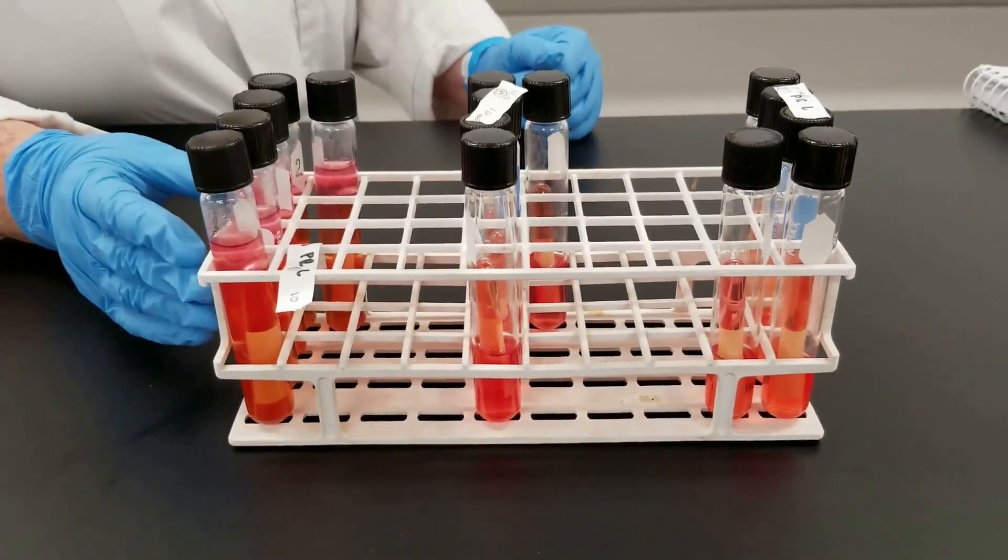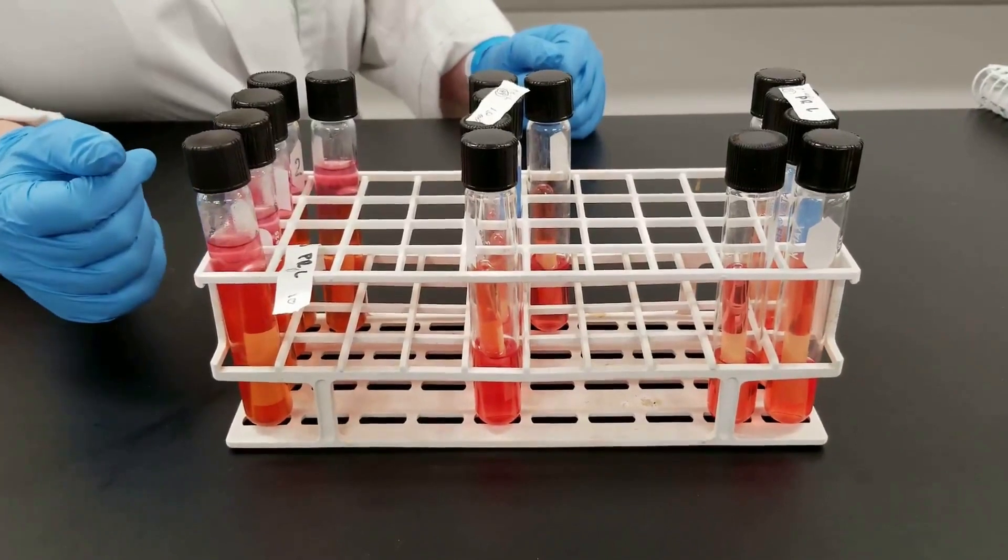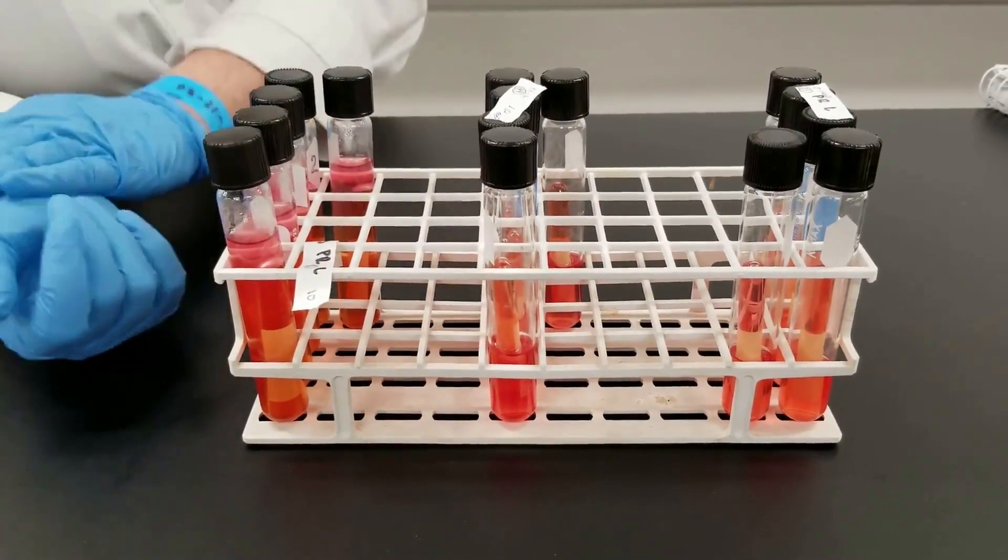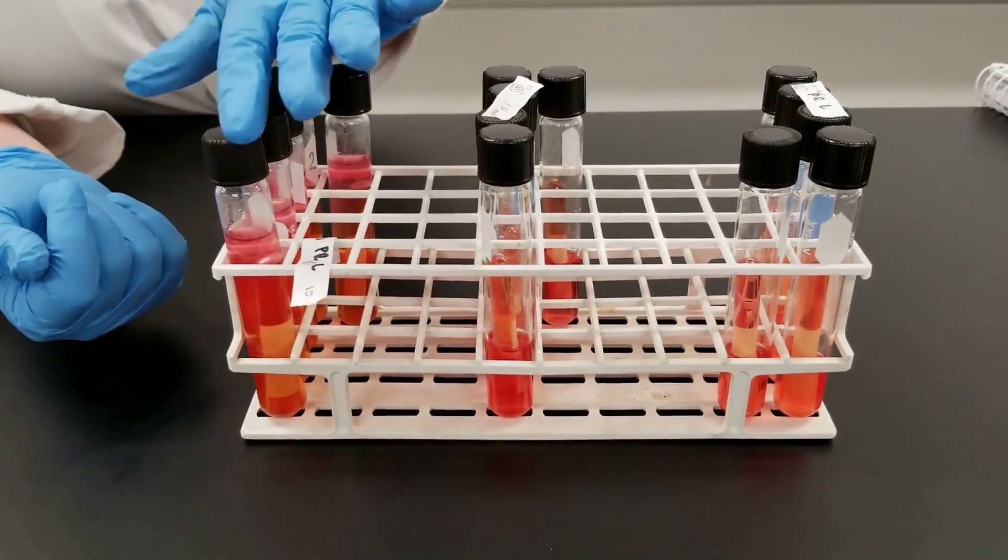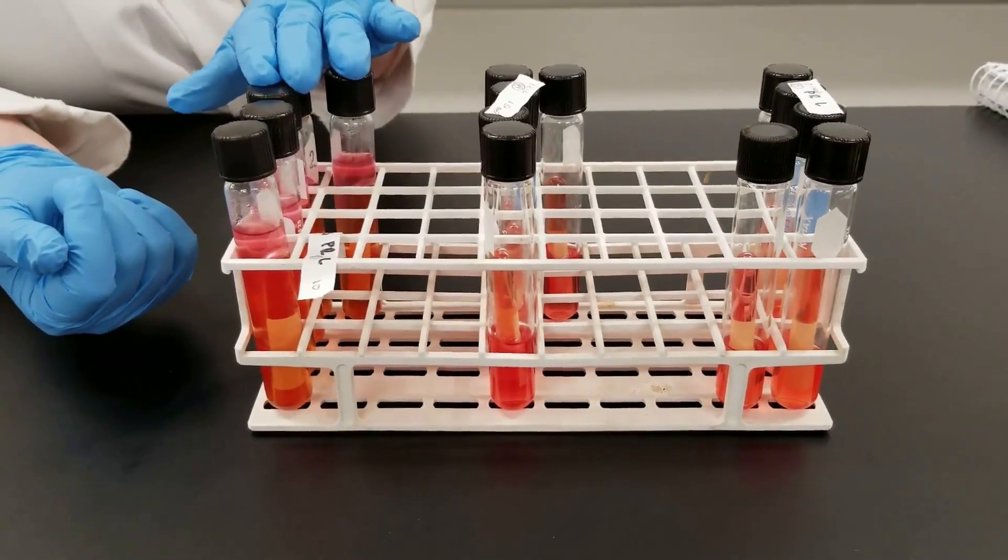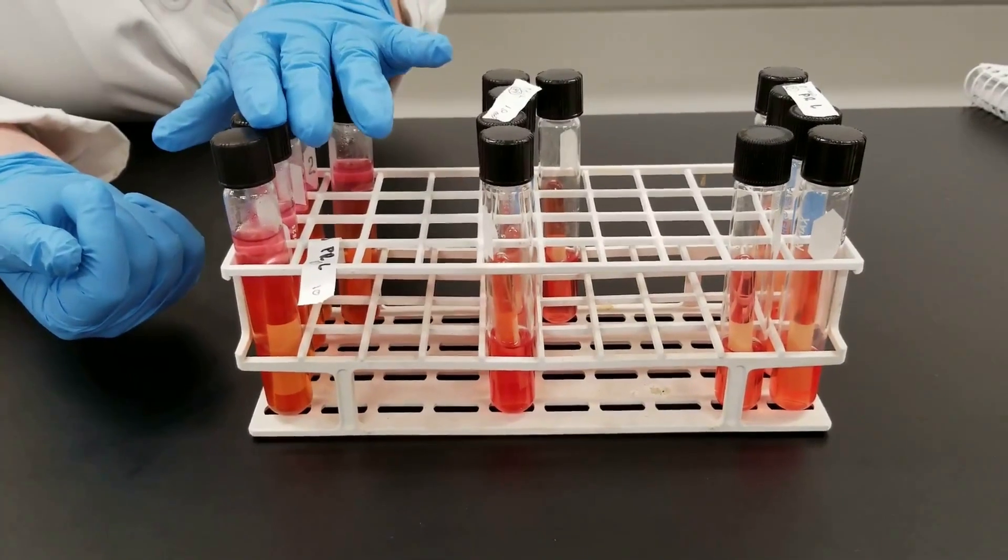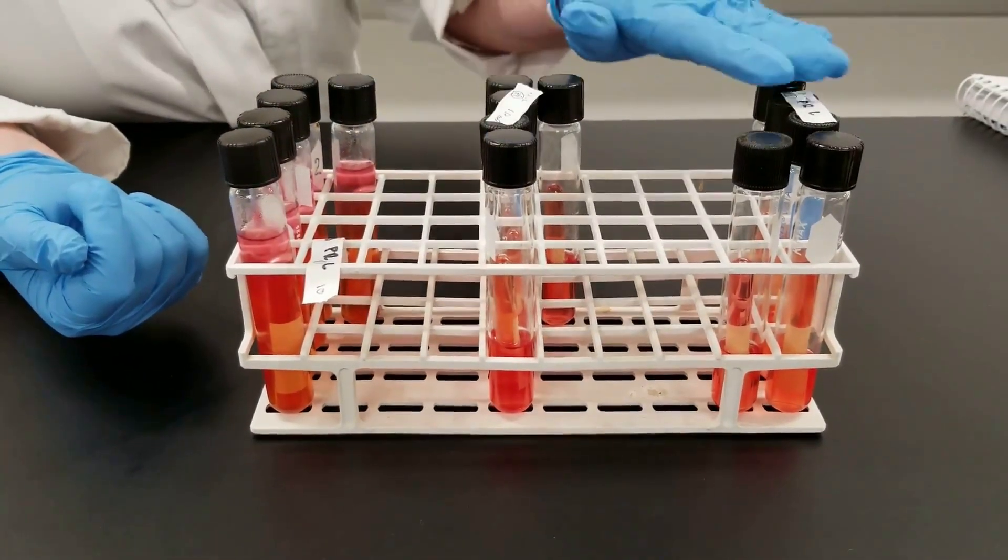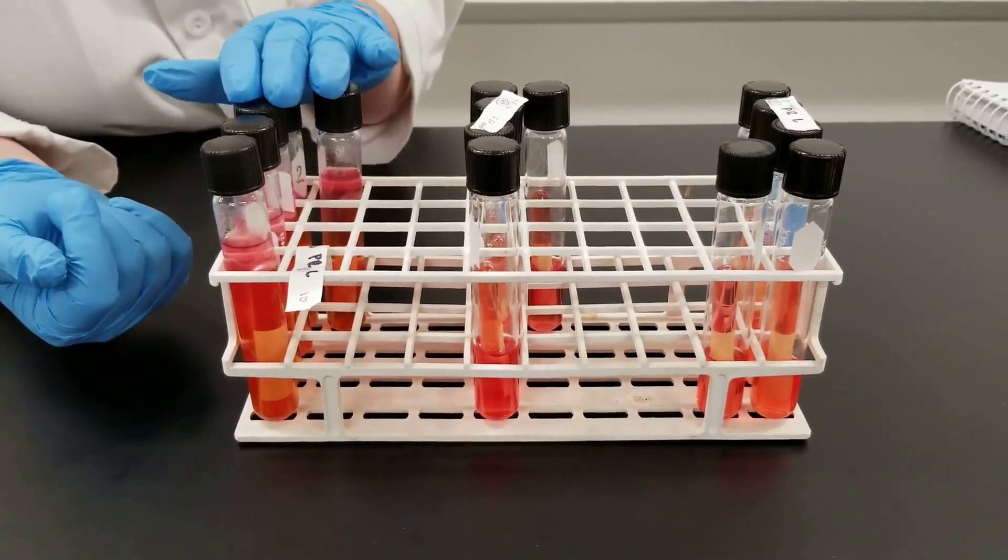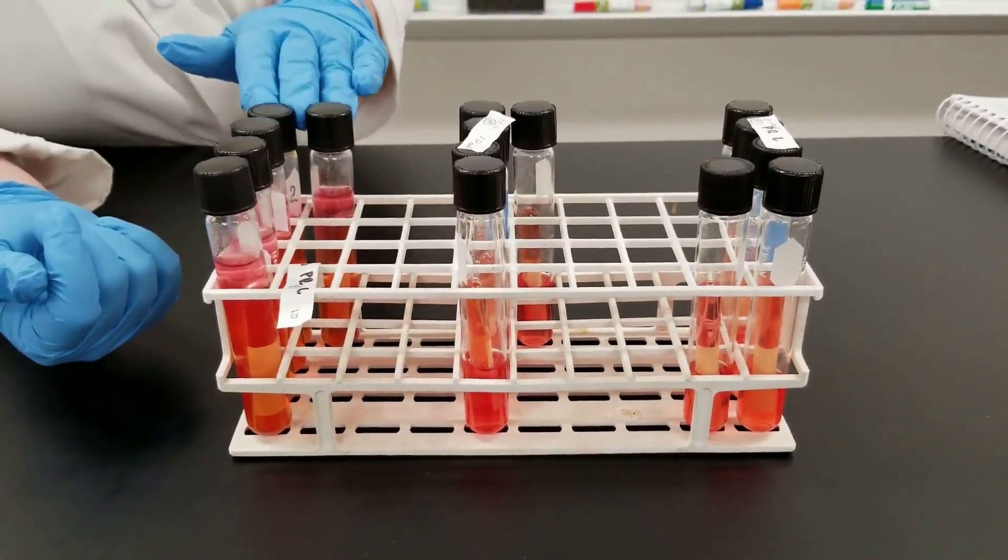So, if some of these had turned yellow, what you would do the way you would normally analyze it is you would count the number of positives, the number of yellow tubes, so the acid production, in each one of these sets. And so you have to record the numbers separately. You don't add them all together.